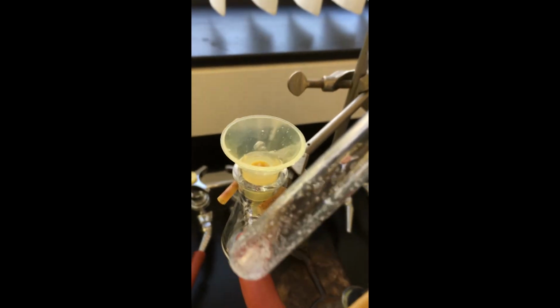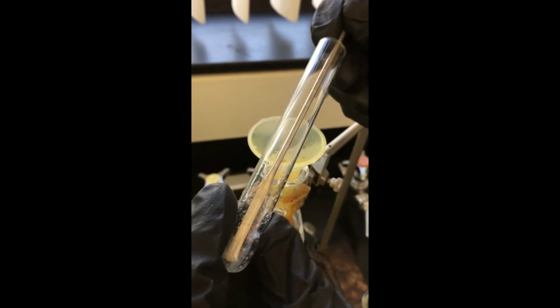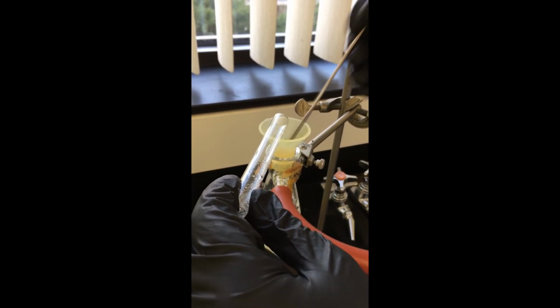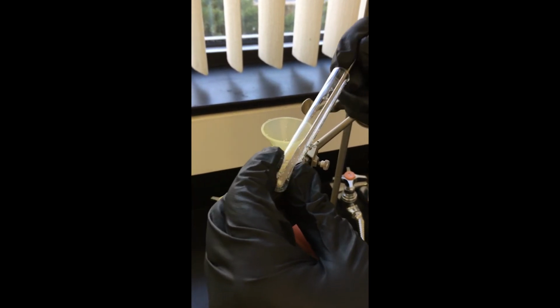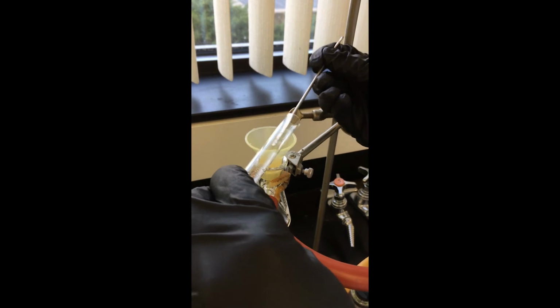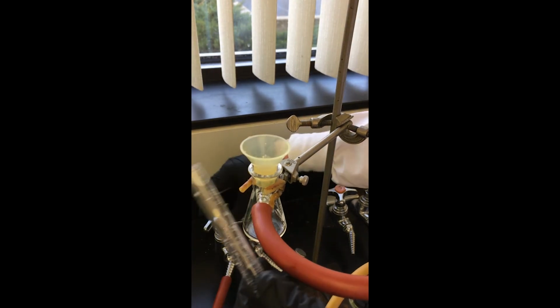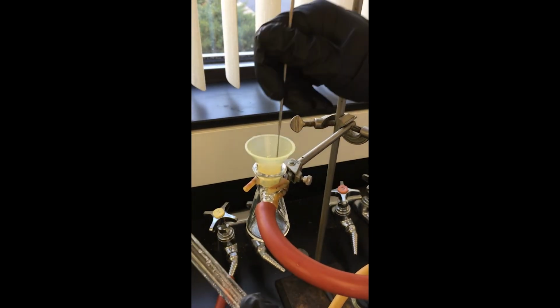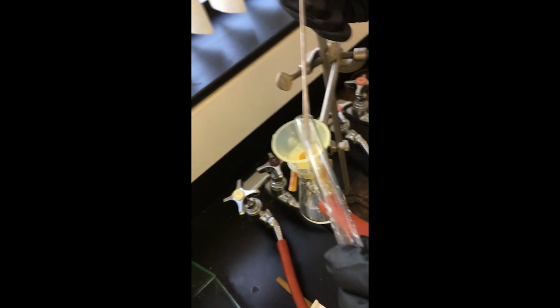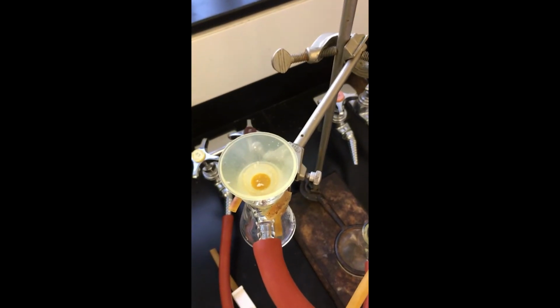Very carefully scrape out all of the residual crystals, so you don't want to leave anything behind. And we have our recrystallized product.